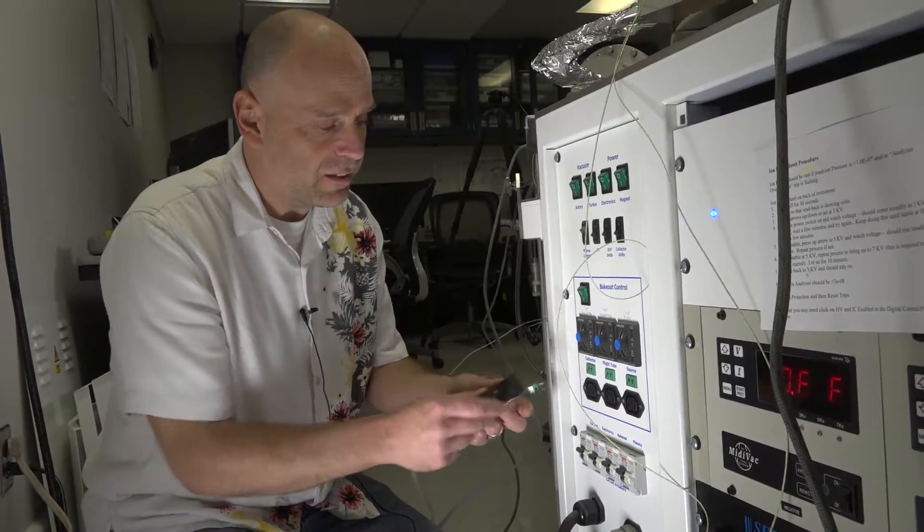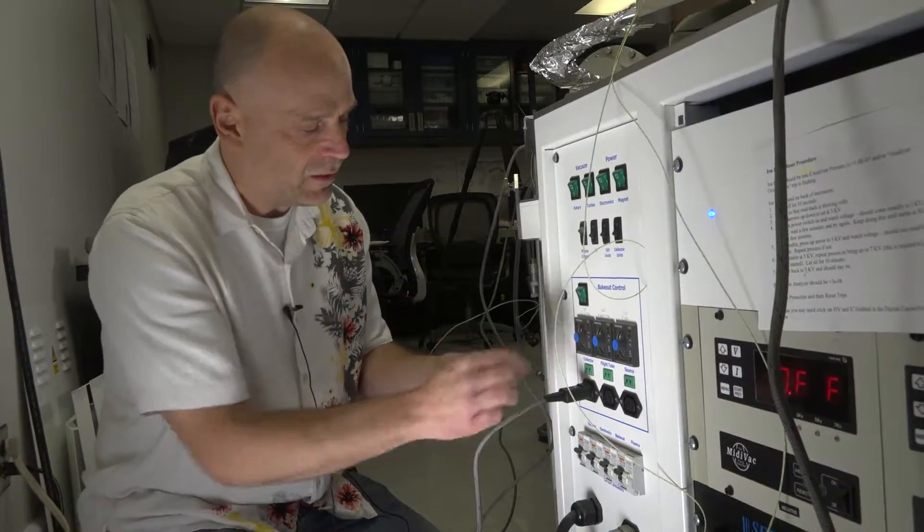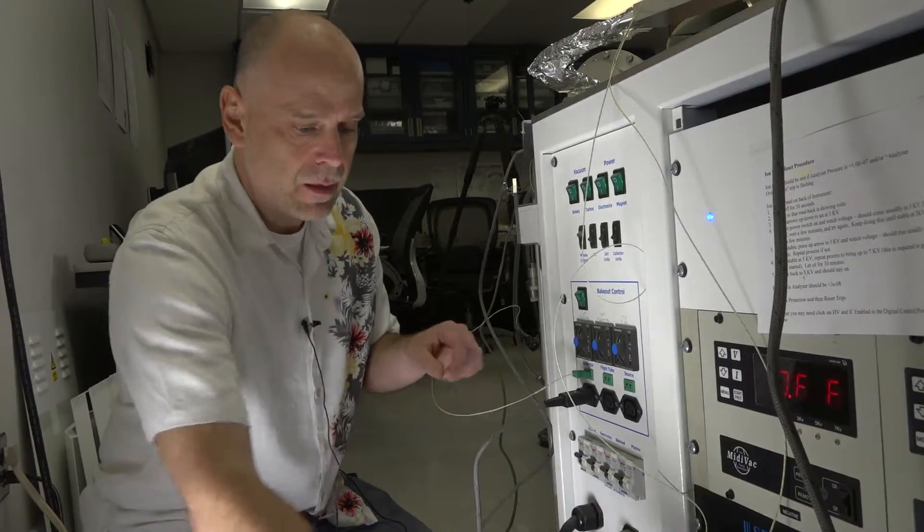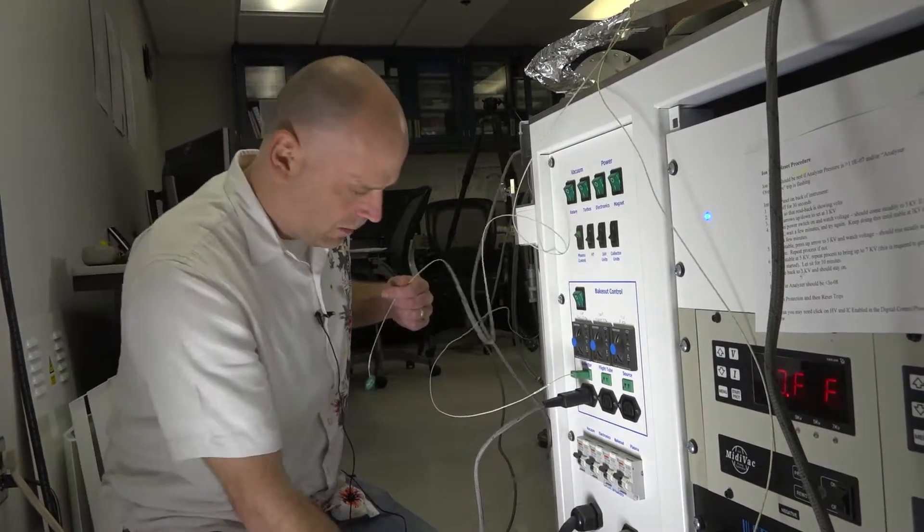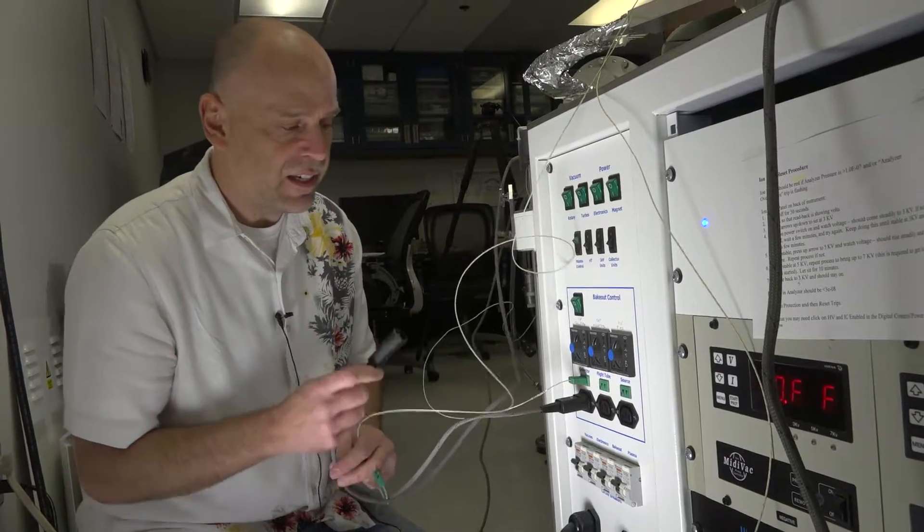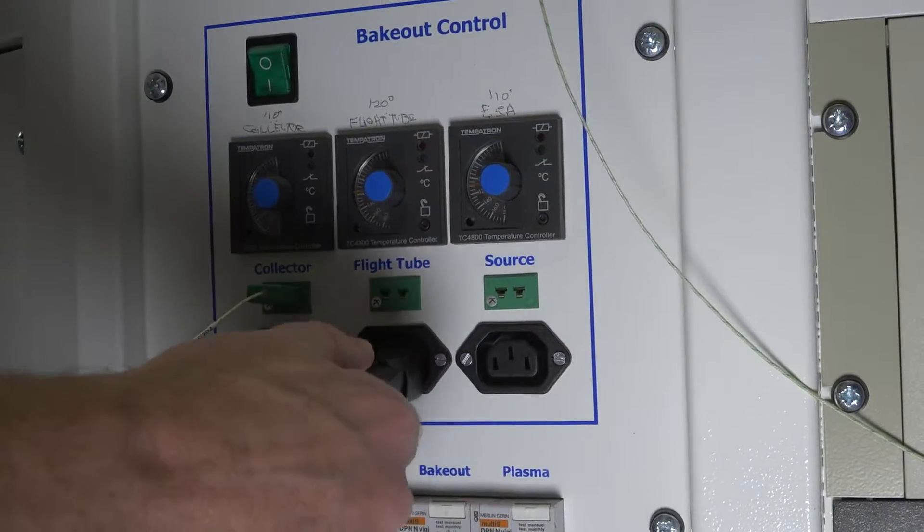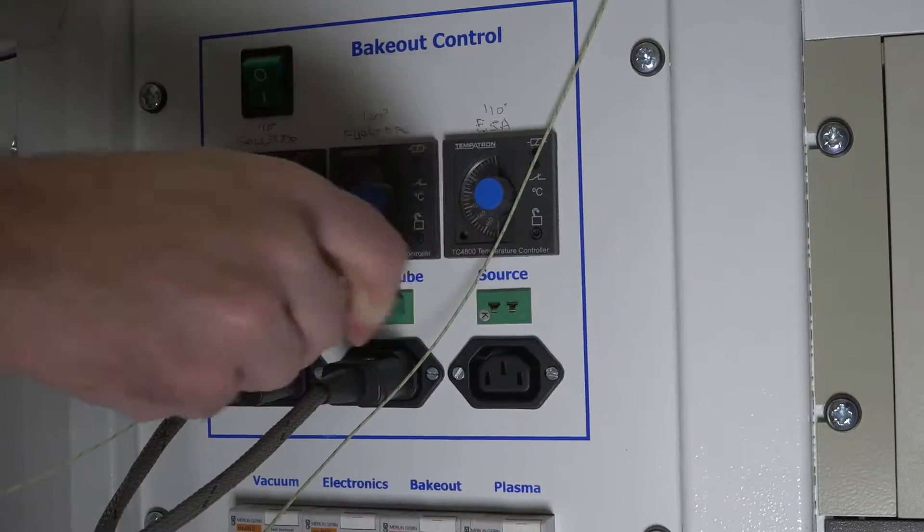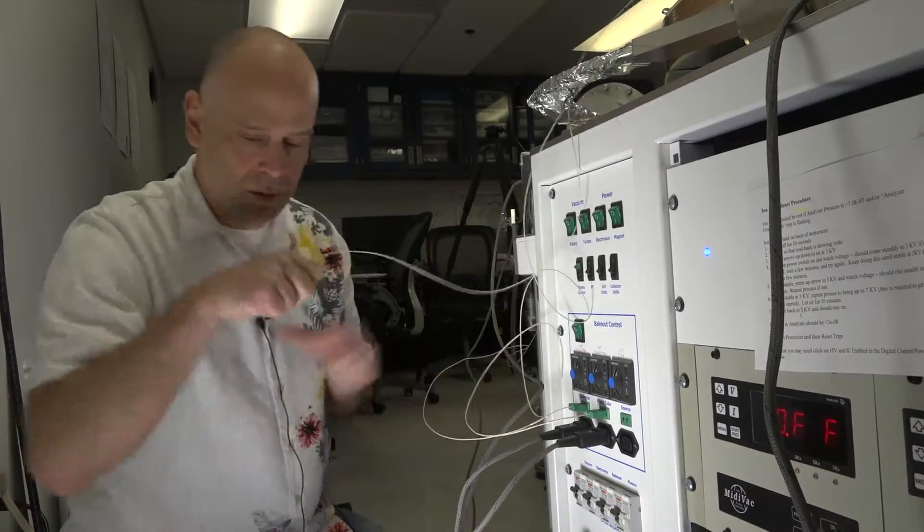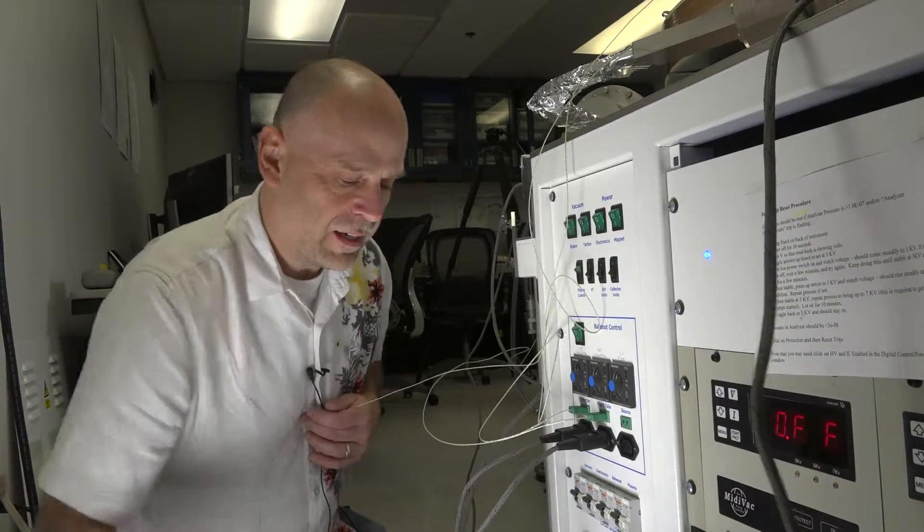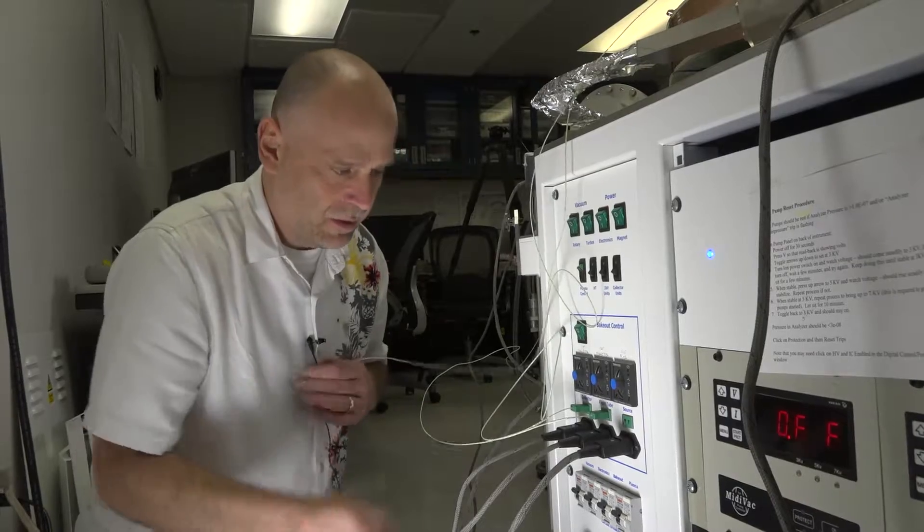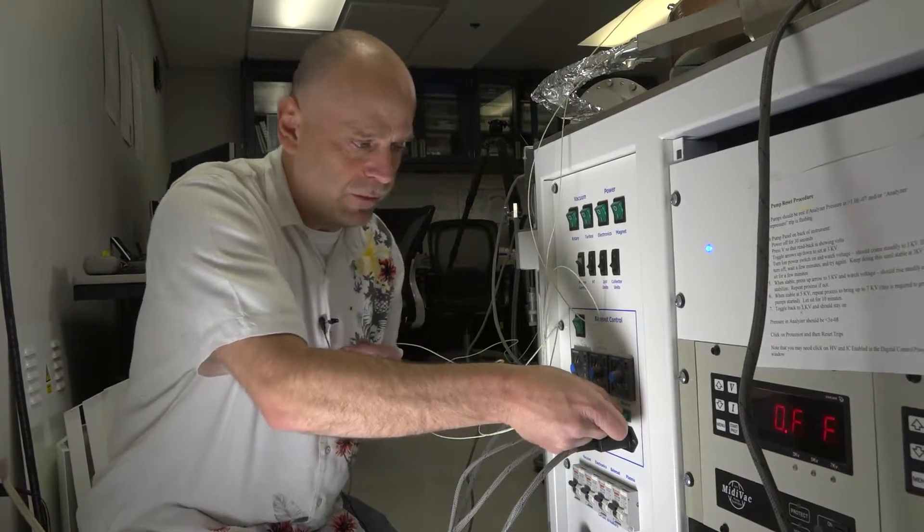Now it's time to plug everything in. First the heating element for the collector and the thermocouple for the collector. Then the heating element for the flight tube and the thermocouple for the flight tube. And finally, the heating element for the source and the thermocouple for the source.